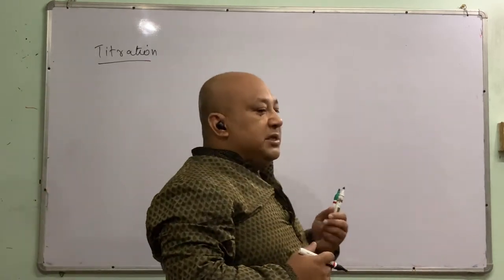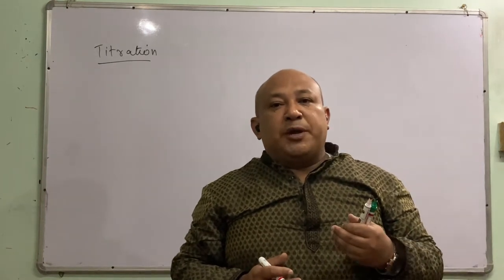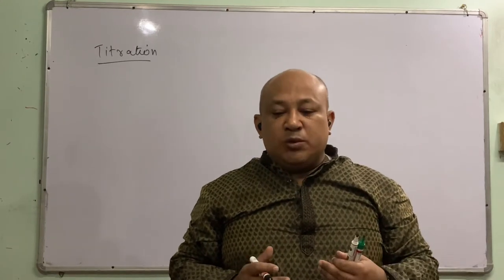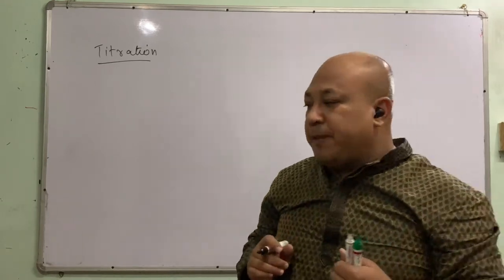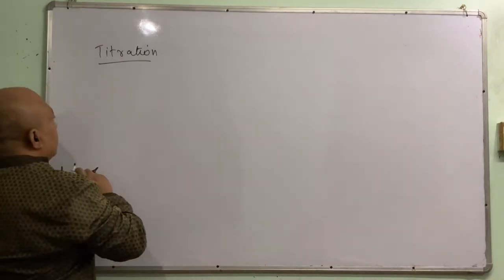Being in civil engineering, students always have apprehension the moment they see the word titration, thinking it is chemistry. So let me tell you the basic fundamental of titration. Based on this, all the chemical parameters can be evaluated. This is something you have to note down.